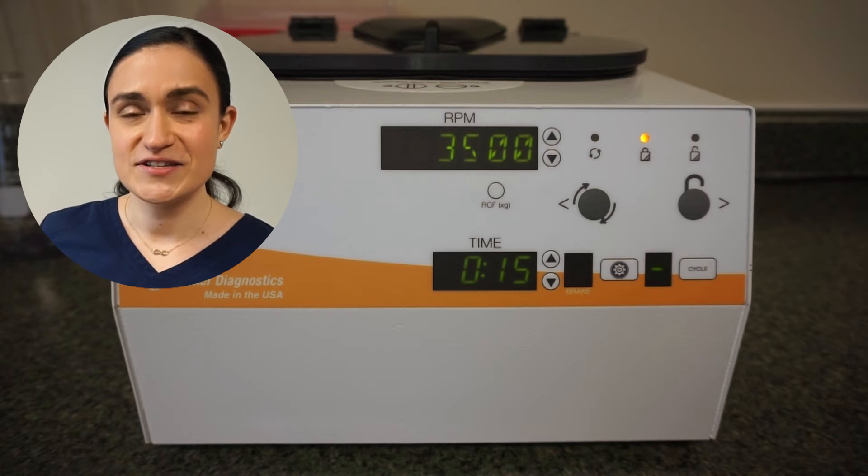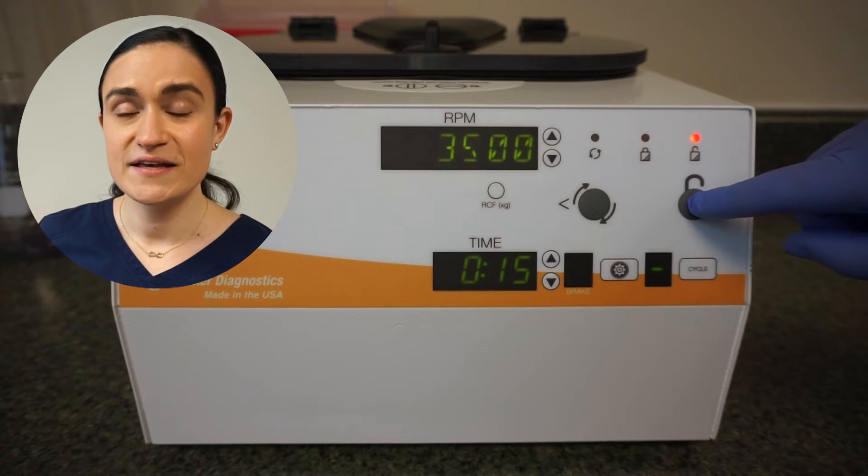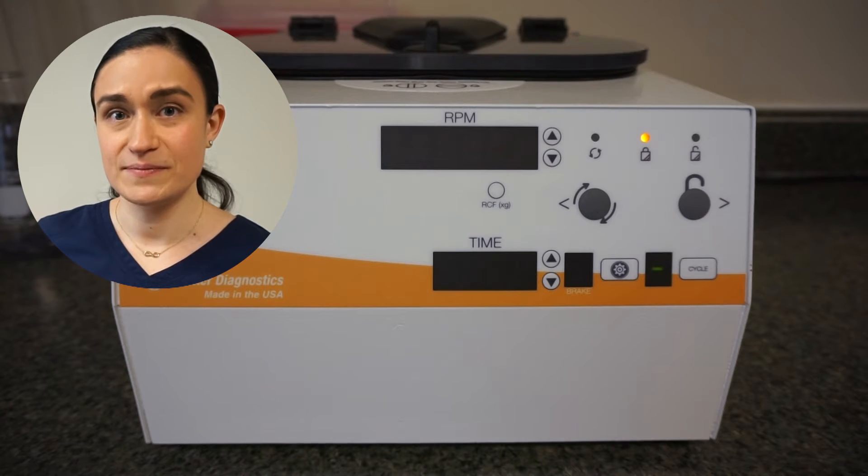First, let's try pressing the stop unlock button. If the centrifuge isn't running, this should immediately unlock the lid. If it is, it should slow down the centrifuge and once it comes to a complete stop, the lid should then unlock.